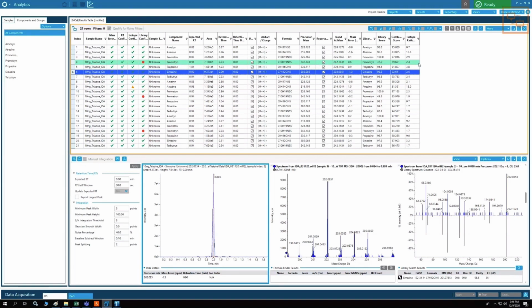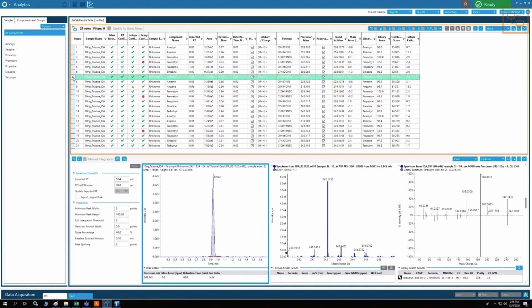No, I saw something wrong. It's the terbutryn. I don't know. Okay, terbutryn, yeah. So what's wrong with terbutryn? I also don't know how to pronounce it. Don't worry, these names are horrible. Pesticides are the worst. What's wrong with terbutryn? Or what can we say about terbutryn and prometryn?